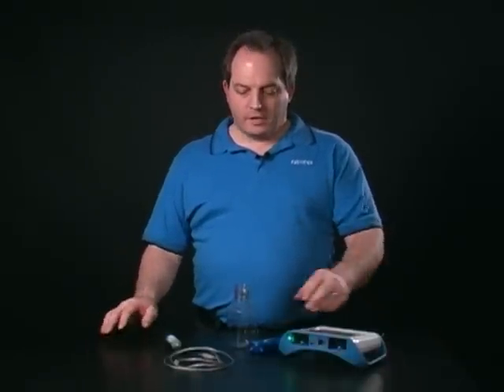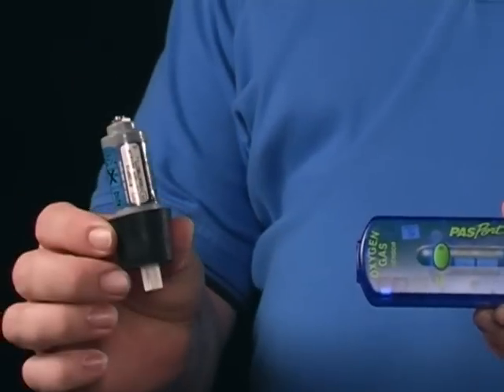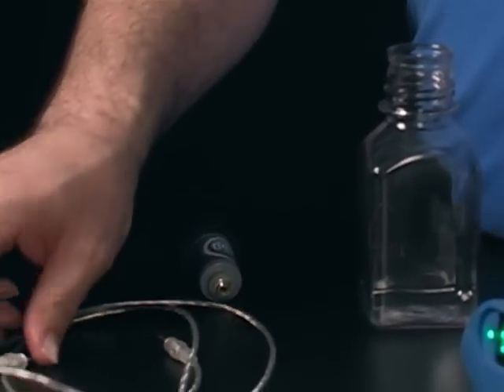Hello and welcome to a quick look at the oxygen gas sensor. The oxygen gas sensor comes in three parts: the sensor box, the sensing element, and the cable that connects them.